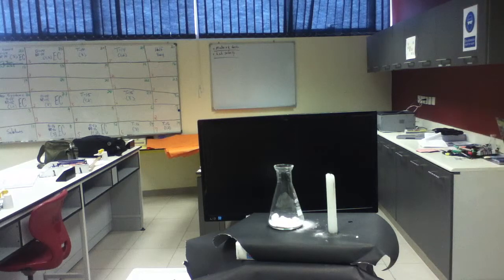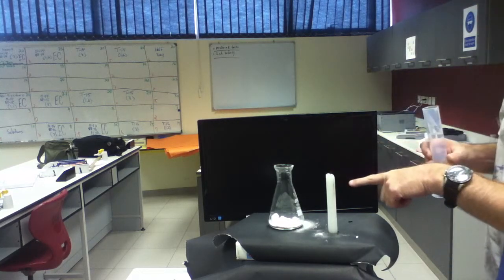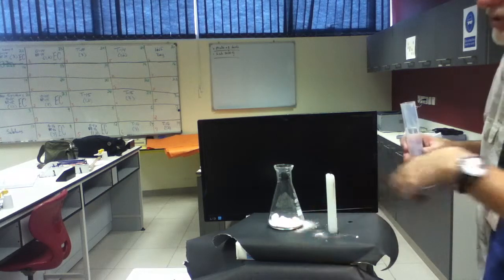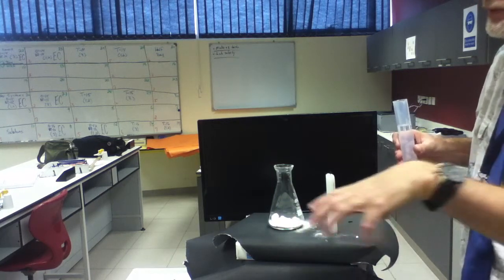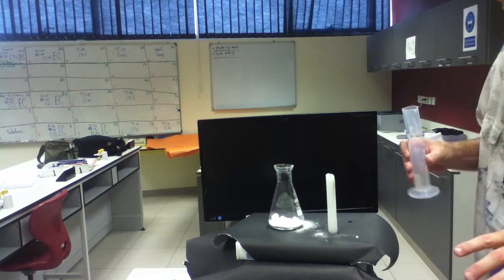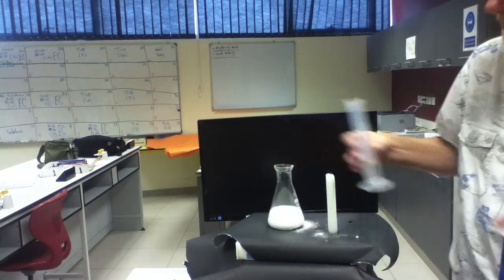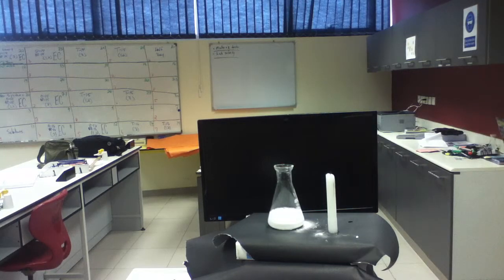So I'm going to do the reaction that's on the board. Sodium bicarbonate. I have black here so you can maybe see the trace of carbon dioxide. Okay, not terribly reactive, but gas is coming off. You may not be able to see it very well. Okay, but it's in there.